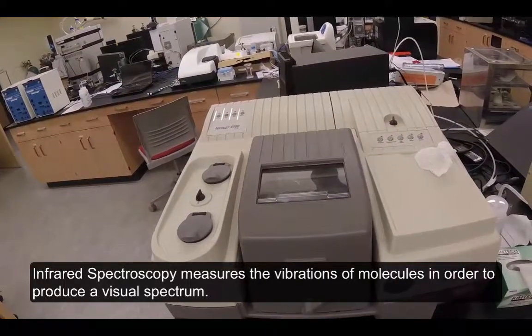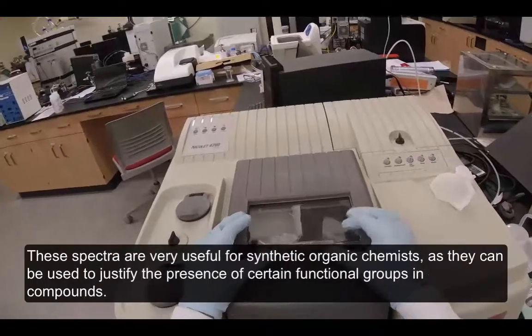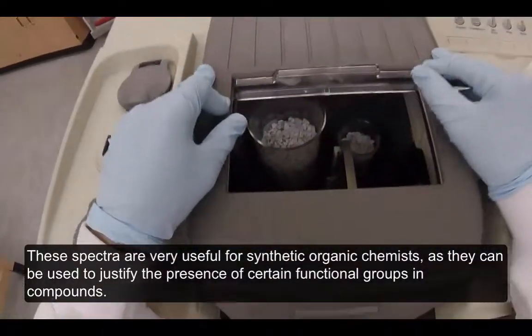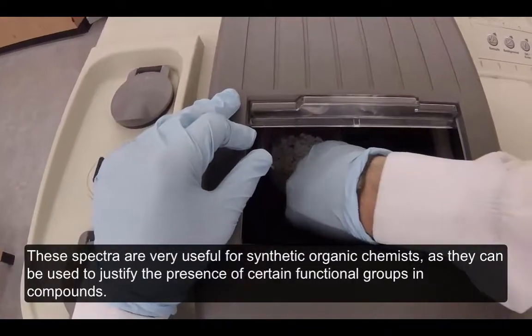Infrared spectroscopy measures the vibrations of molecules in order to produce a visual spectrum. These spectra are very useful for synthetic organic chemists as they can be used to justify the presence of certain functional groups and compounds.